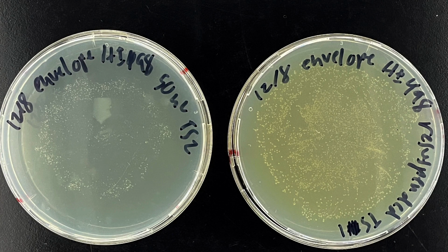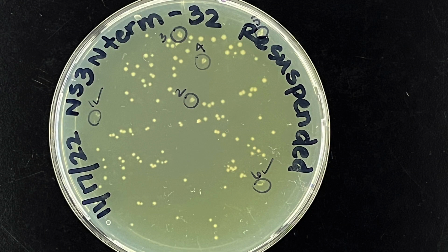Now, here's an example of a cloning attempt that was a little bit too efficient. You'll notice that even on the 50 microliter plate, there are way too many colonies. So in this case, we probably would have to plate it less or even do a dilution prior to plating. Now, it's better to have too many colonies than no colonies, but still at the same time, sometimes it's one of these things where you just have to kind of know the cells that you're using and the cloning attempts that you're doing or the cloning strategy that you're using in order to find the right amount to plate.